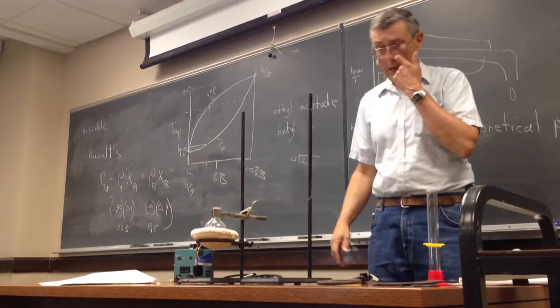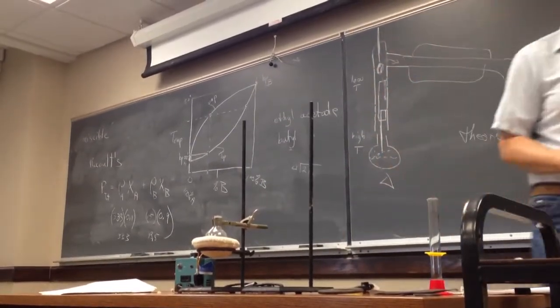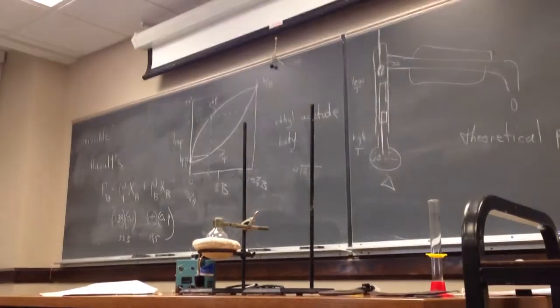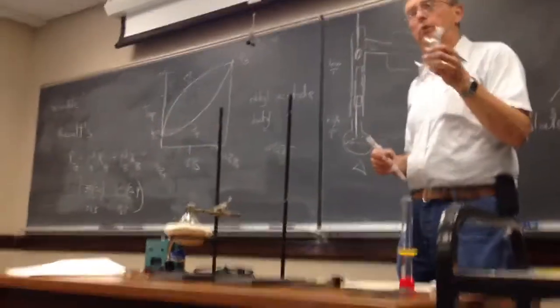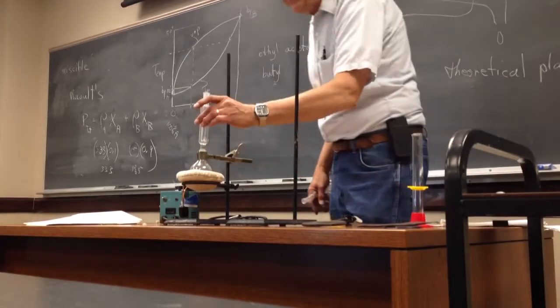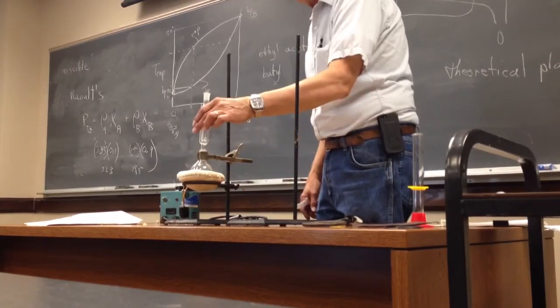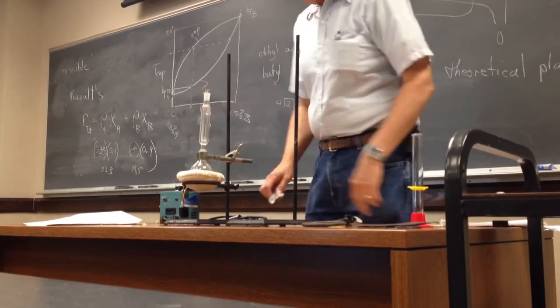So we've got that. Now I'm going to put the column in, this thing, to do separation. I'm going to use a condenser as a column. I'm going to pick this one. Doesn't really matter. It's just a glass tube. We can just use a plain old glass tube if we wanted to. And it'll set in there all by itself. Gravity holds it. There's no need to do anything. Do not clamp this as opposed to the flask, because if I drop the mantle and I was holding on to this, what's going to happen to the flask? It's going to go down too.